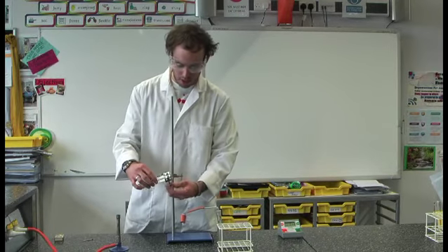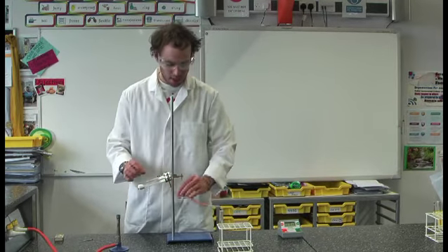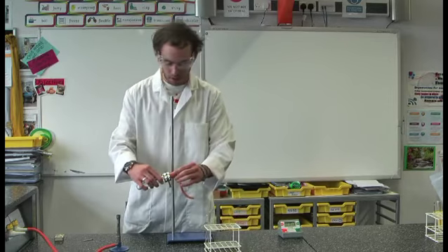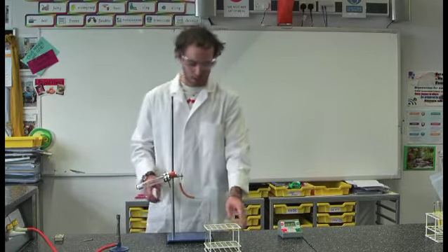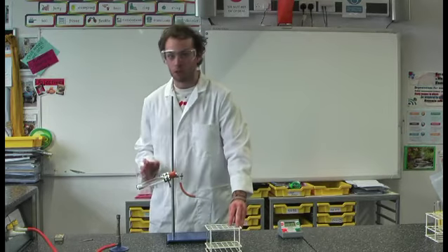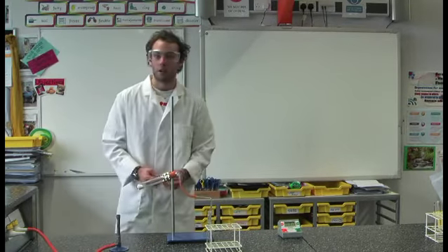Place your delivery tube into your clamp and attach the delivery tube. This delivery tube flows into a test tube which is full of lime water. And now you're ready to begin the experiment.